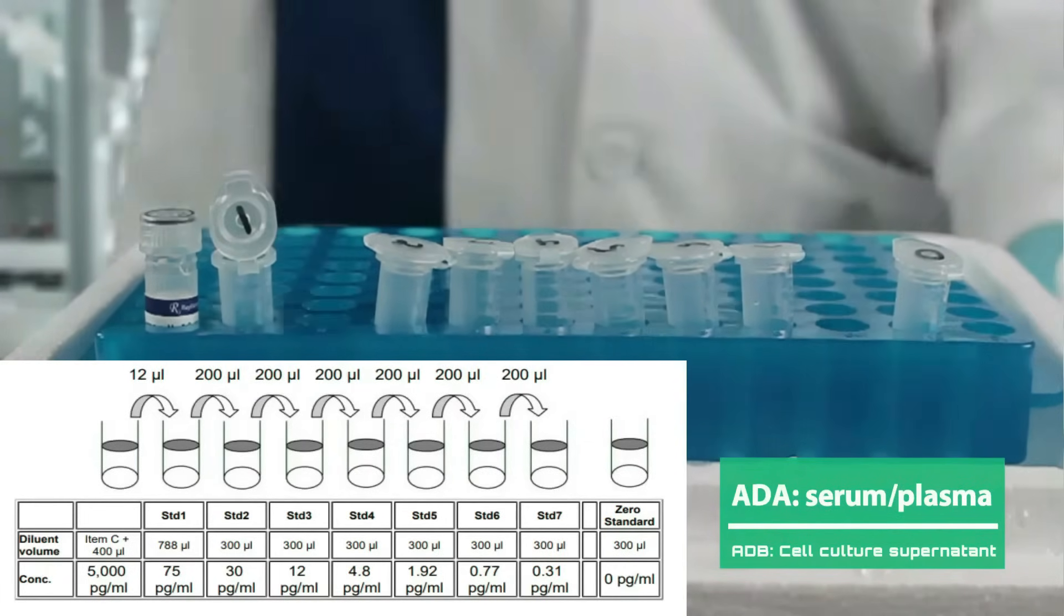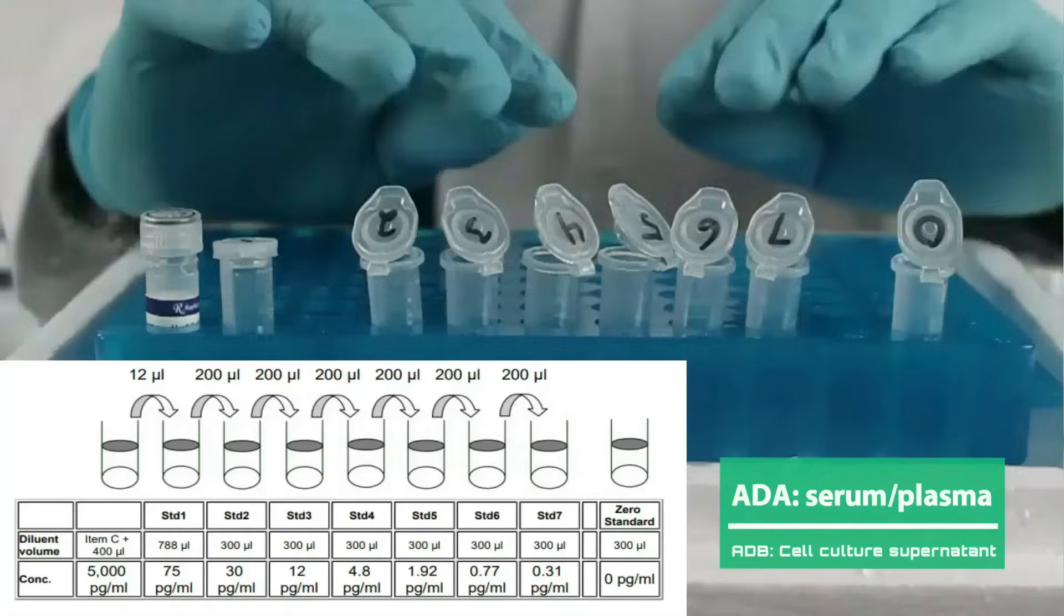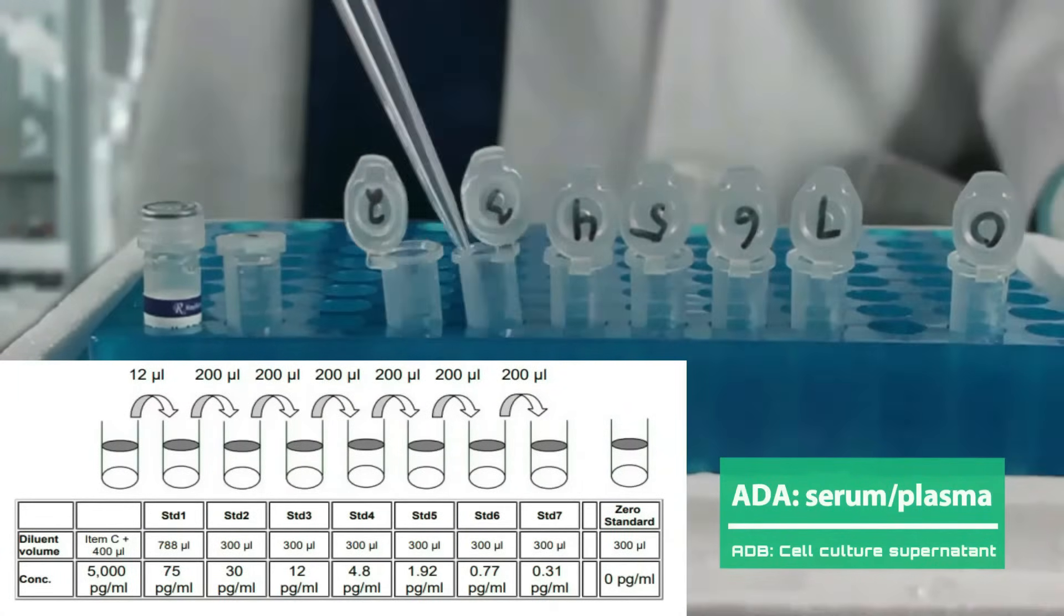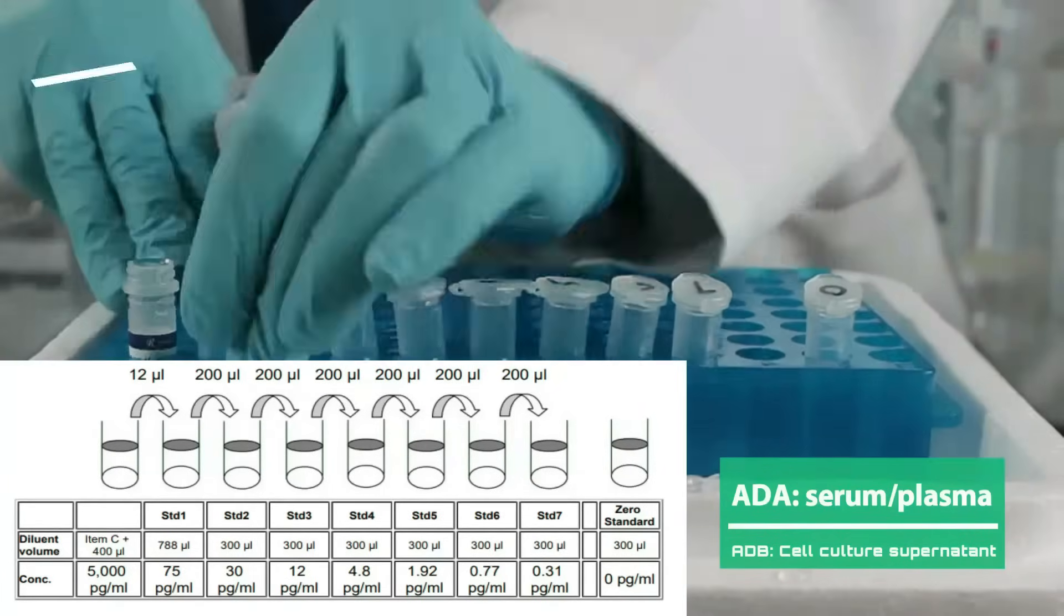Good laboratory practices are always to spin volumes down prior to diluting. When you mix, it will be with the full volume. This helps with our precision. Once this is complete, you are ready to start the standard curve.